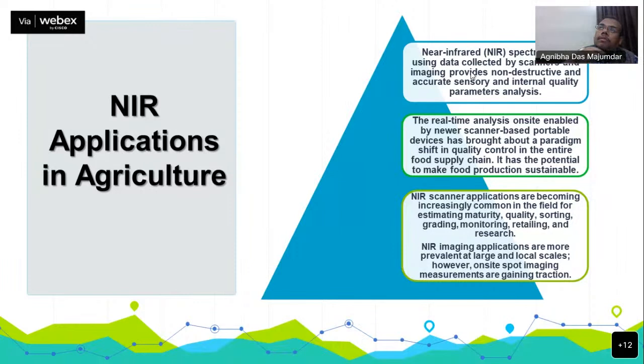So I have to put some n-hexane to the sample and evaporate it, so we have to heat up this sample. After the evaporation of the n-hexane, we get some residues, and we collect the residues as the amount of fat present in that particular sample, the mango pulp.